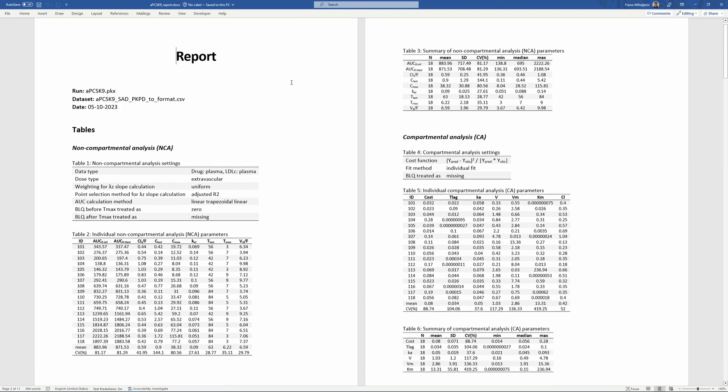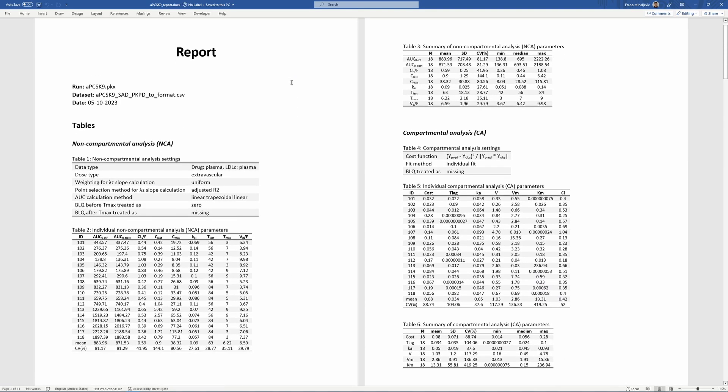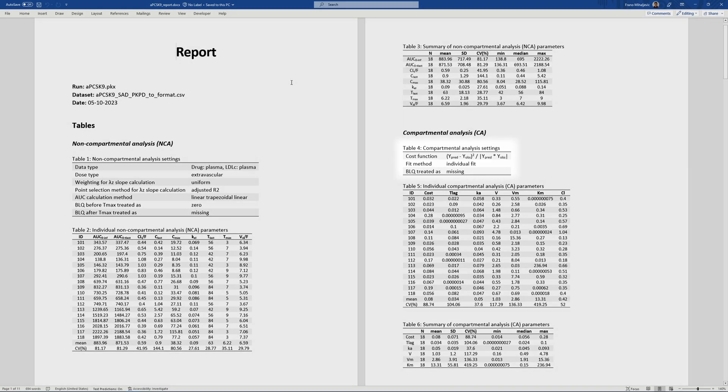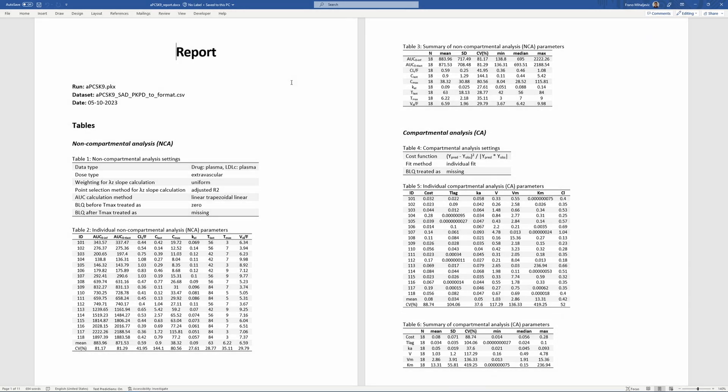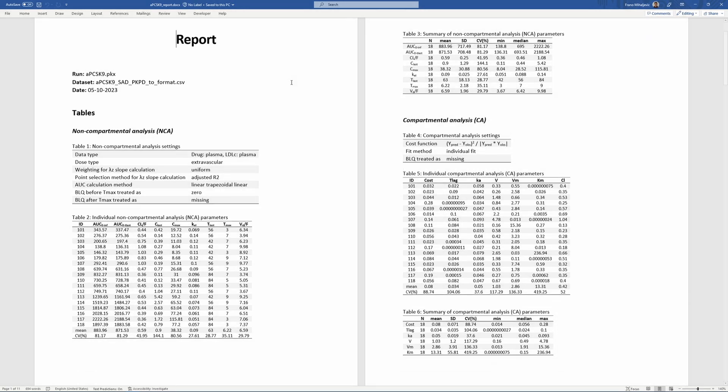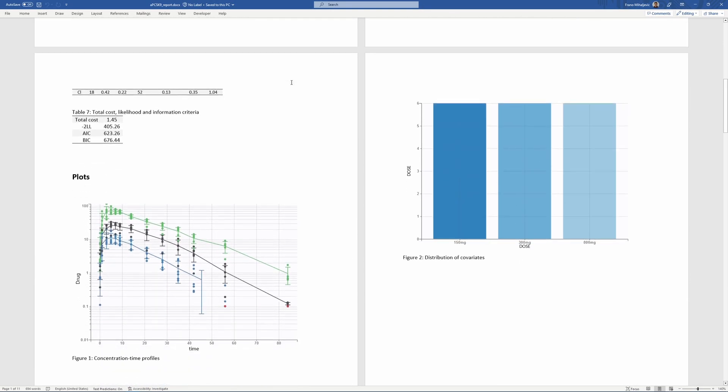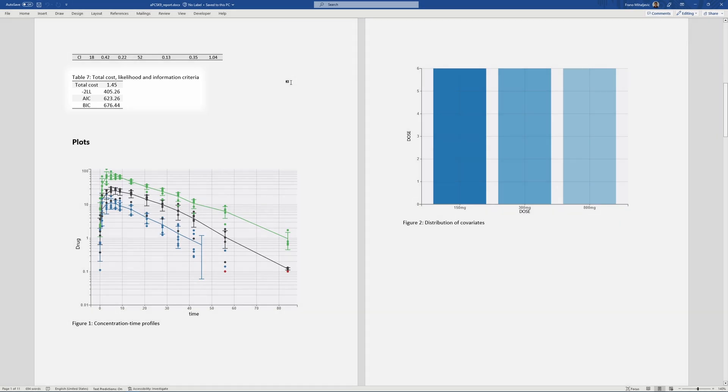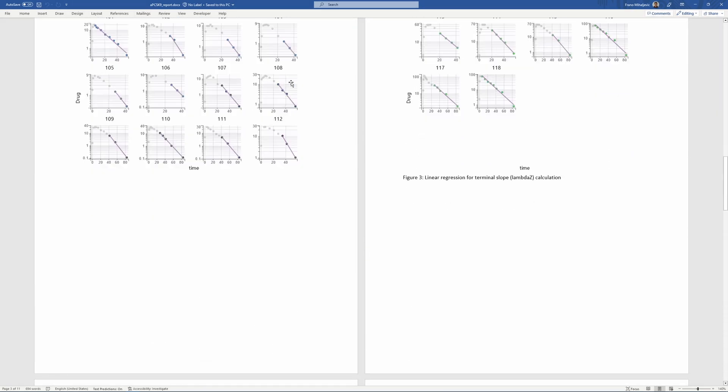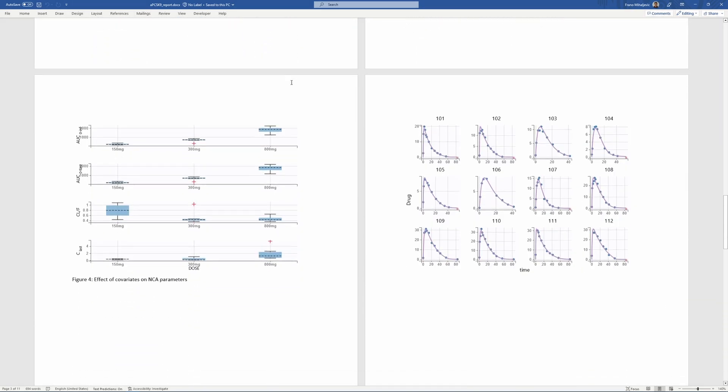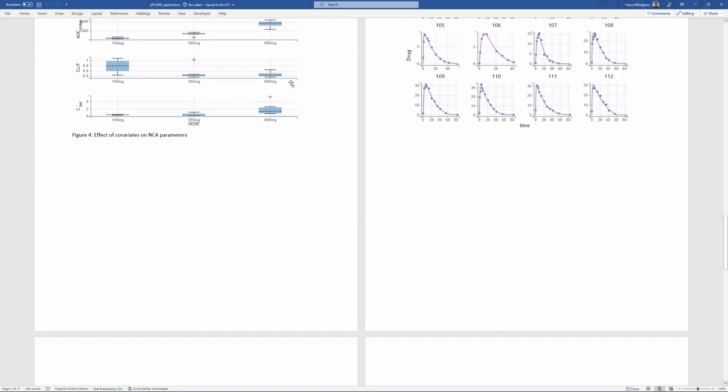If a project contains CA results, the report will also contain table with CA settings, individual CA parameters, a summary table, and a cost table, in addition to all the plots available in the interface.